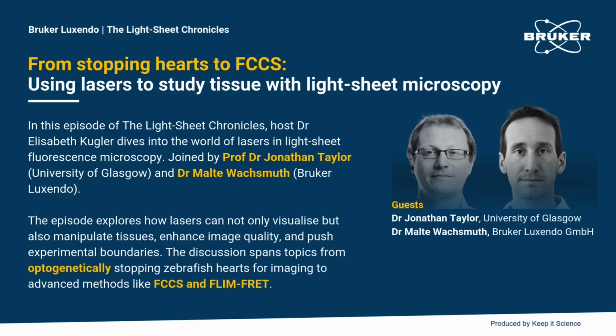There are so many interesting approaches, and especially as a biologist, it's really exciting to see that we can use lasers in so many different ways, and also the actual computation to really get the most out of our data. One thing that we really wanted to discuss in this episode is more advanced techniques, because especially in the last few years, we've made huge steps in using, for example, FRAP in many different labs. So I thought it was really important that we discuss things like this today.